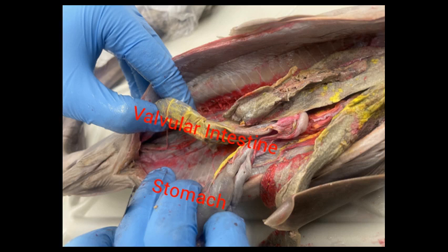It has acids which help break down the food to help pass it along the digestive tract. The rugae in it, which is a really interesting part of the stomach, allow the animal to overfeed by allowing the stomach to expand. This is really important because sharks aren't like us in the sense that they can't just get food whenever they want, so they eat what they can because they don't know when their next meal is going to be.